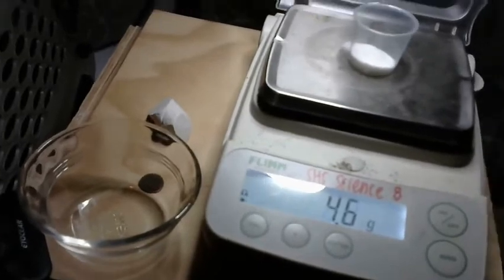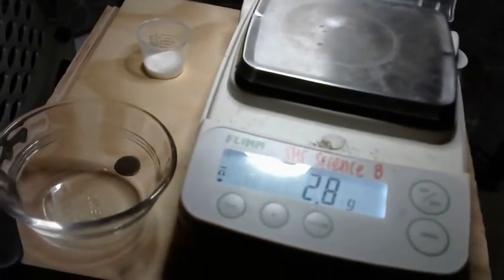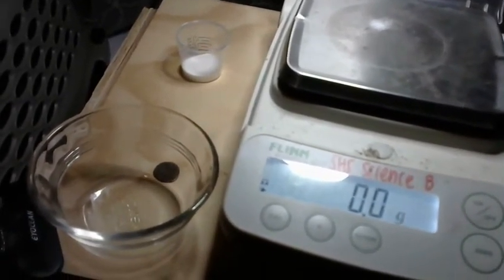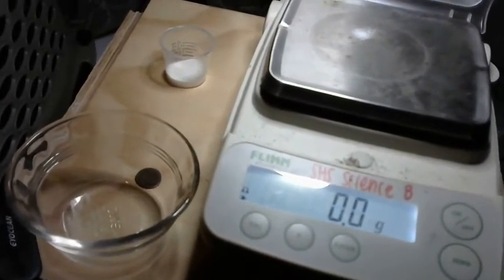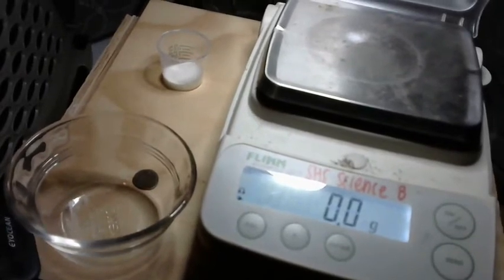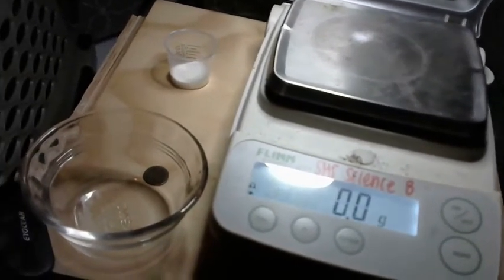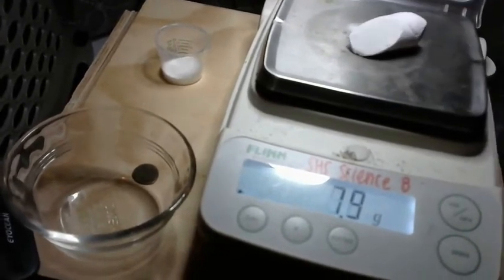Okay. Now, our very last one that we're going to do is find the mass of our piece of chalk. The main idea here is you need to determine how many atoms there are in a written name. So I'm going to figure out how many atoms I have before I write my name.